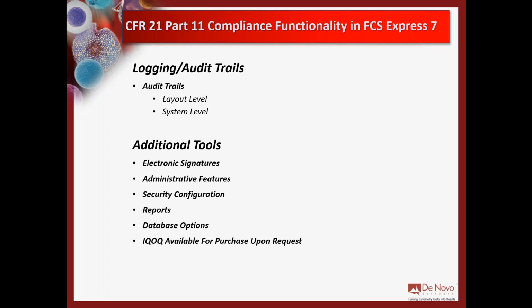But we've also just added system level audit trails to FCS Express. So the latest release that has come out in just the last week or two, the last week in January 2021, the system level audit trails will be there. And that means that when you do things like add a user, when you save a layout, when you print a layout, when you change a preference in the software, all of that stuff can be tracked and reported.